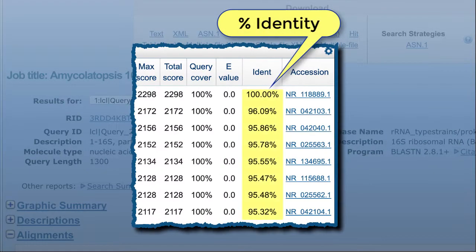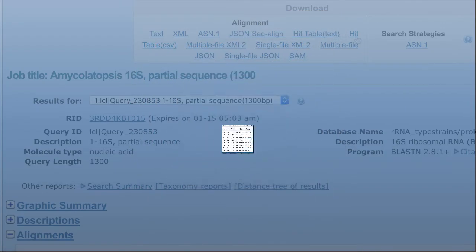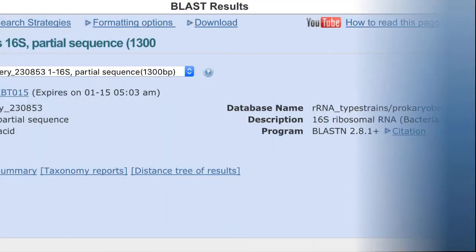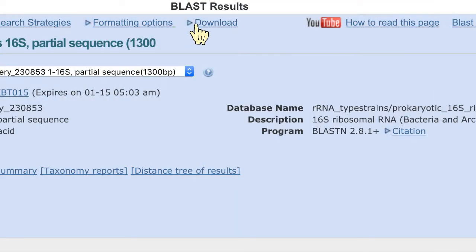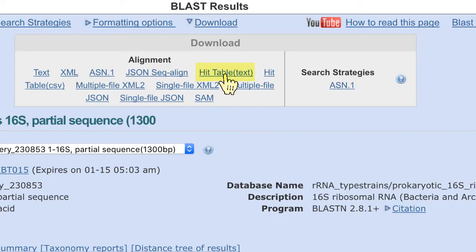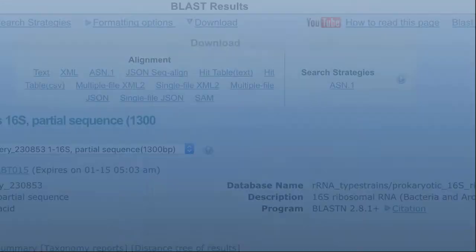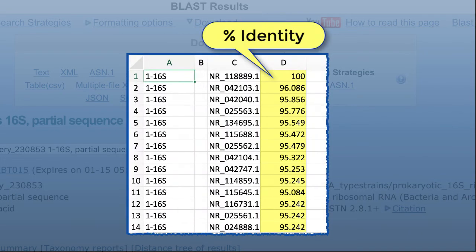Finally, you may have noticed that we now provide percent identity to hundredths of a percent. If you need another decimal place, download the full results in one of the HIT table formats.